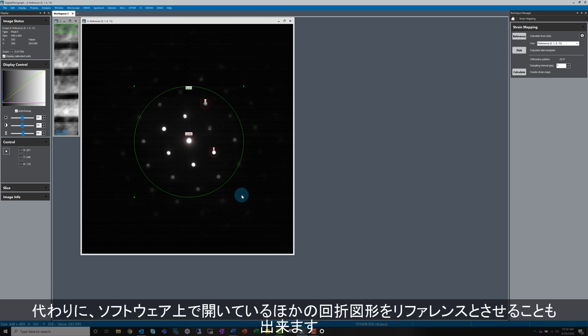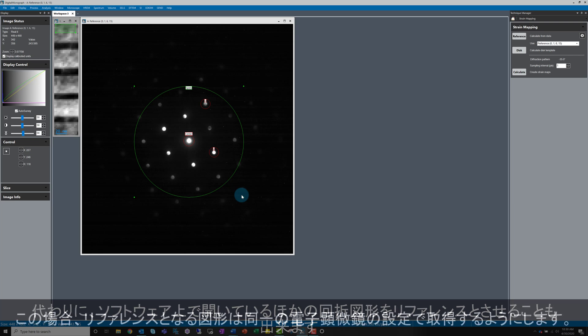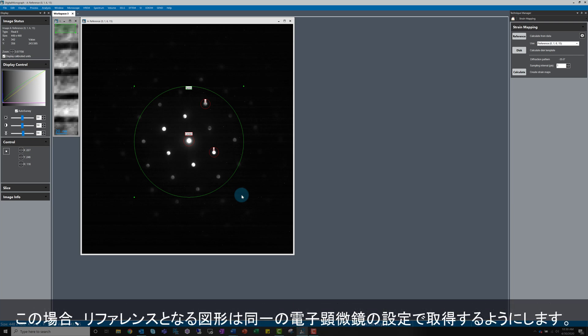Instead of using the reference pattern we just generated, there is an additional option to use any other diffraction pattern open in the software. If you want to do this, it's important to make sure that the data was collected with the same microscope conditions.